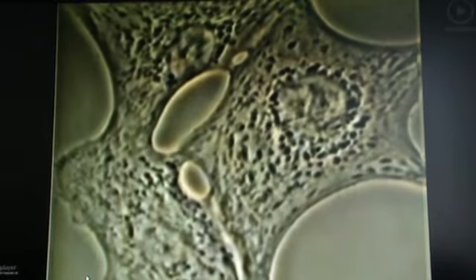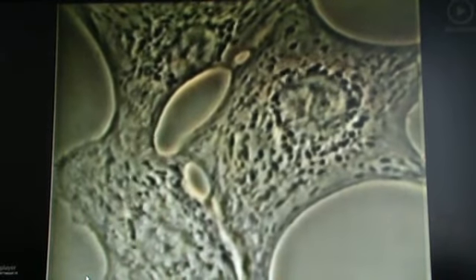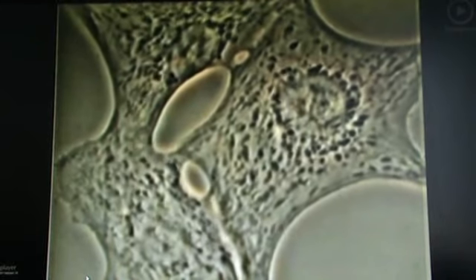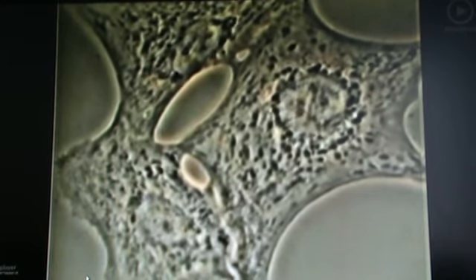This living heart muscle cell culture shows, at first, the normal rhythmic synchronous contraction and dilation. After provoked irritation, the formation changes into an asynchronous tachycardia and then into a state of fibrillation. Eventually, the cell on the top left dies, followed by the cell on the bottom left.